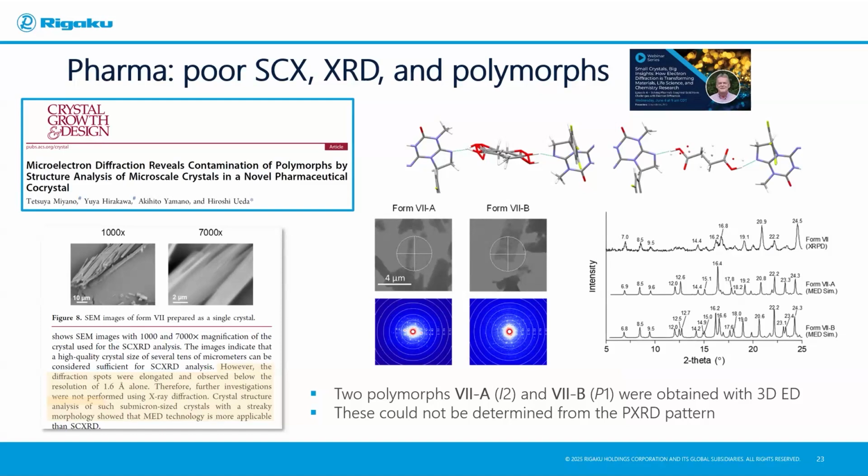It was totally ambiguous data, very poor quality, which then was later on understood better that one reason for this was that this is actually not one polymorph or one form, but two of them, which were never properly distinguished, which could then finally be distinguished in electron diffraction. The powder patterns were understood and everything was good. It's quite a nice paper that we have here.